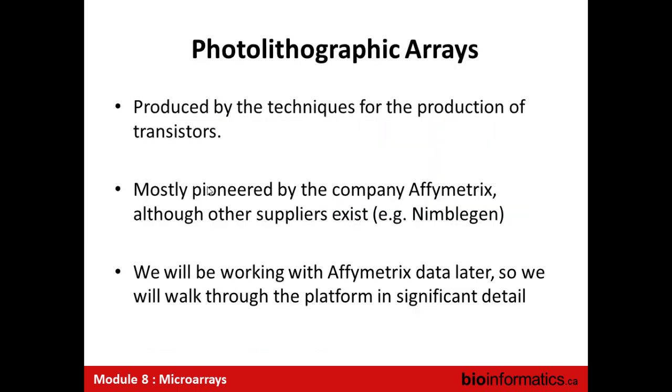The other type of array that we'll talk about in a lot of detail are what are called photolithographic arrays. So photolithographic arrays were being developed right at the same time that Pat Brown's group was looking at printed arrays. In fact, they were both in California, both at Stanford, in different divisions. One was in robotics, and the other one was basically looking at the techniques used for making computer chips. They coexisted for a long time, but photolithographic arrays are likely to be the last standard microarray technique because they have very good error characteristics.